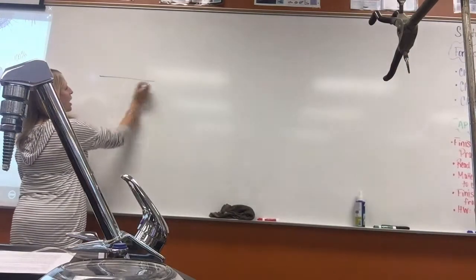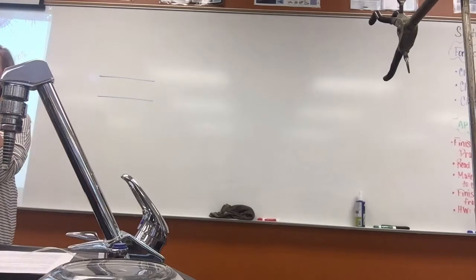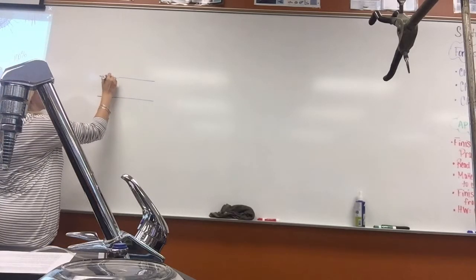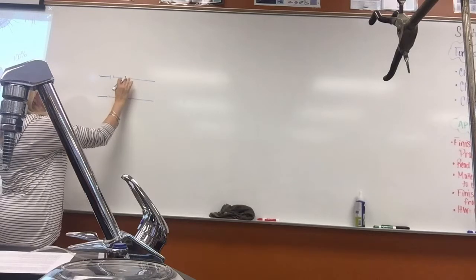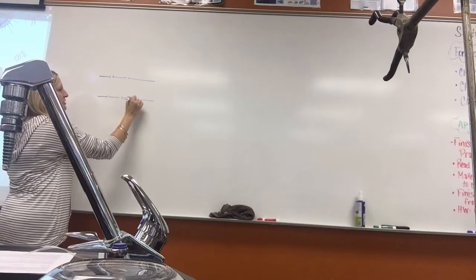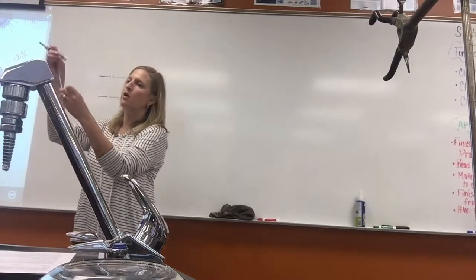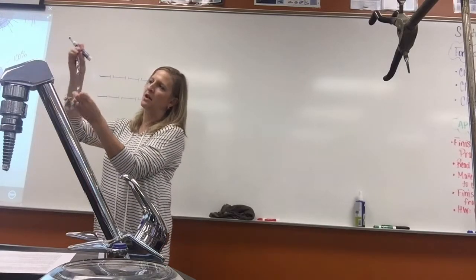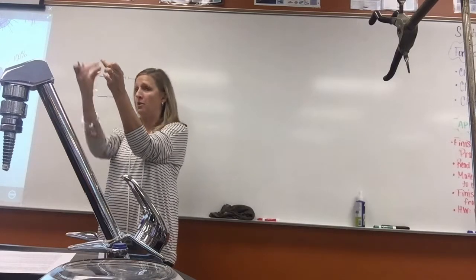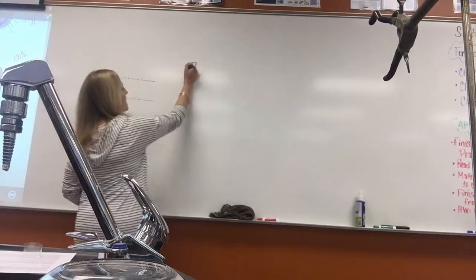We use it for making artificial cells, because it has pores in it. They're microscopic, you can't see them, but the pores have a certain size. It's called dialysis tubing because it's a tube. Right now it's dry and not pliable, so you have to wet it. If you wet it and rub the end, it'll open up, and it's a tube all the way through, open at both ends. When it's wet, you can make artificial cells.